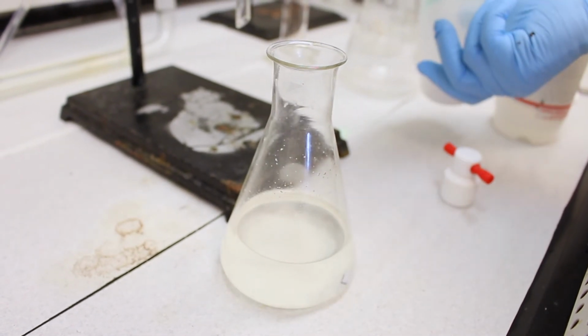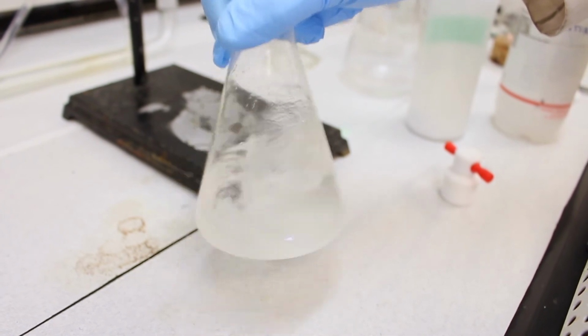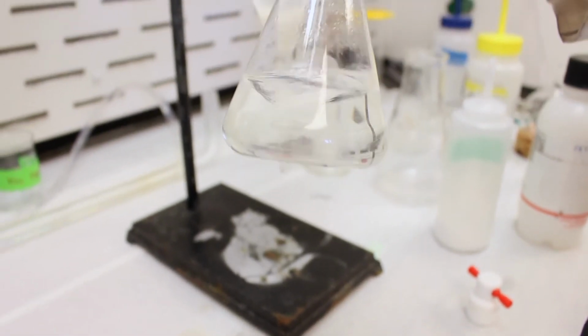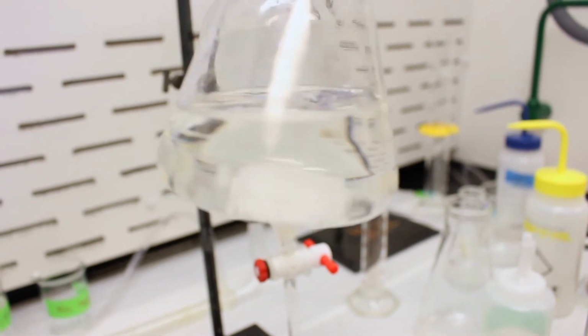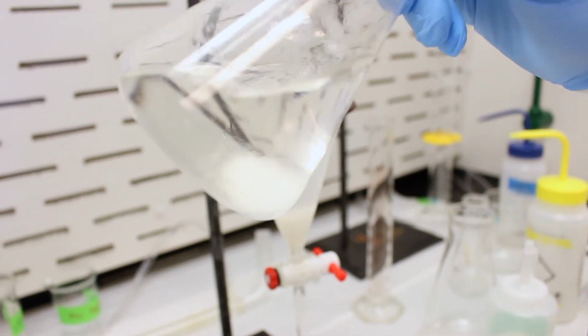There we go. That should do it, so let's swirl it again. Yeah, now this looks much better. So you can see when I swirl it, there are small particles of sodium sulfate flying around, so it's no longer clumping. And the solution is crystal clear.